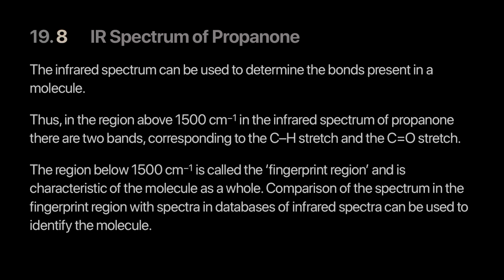Now let's look at a couple more examples and then maybe it'll make more sense after this. Okay? And somebody asked, how will I know if it's an aldehyde or ketone? By using the graph, you cannot know. Nope. The other ways, not through the graph. So the graph is not a foolproof method, it's limited. And they want to play with that limitation and see what you guys can understand from it.